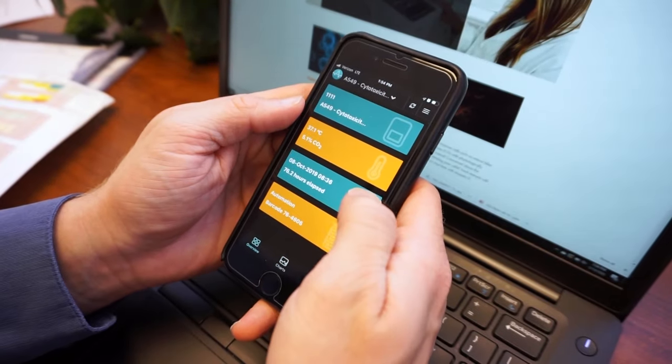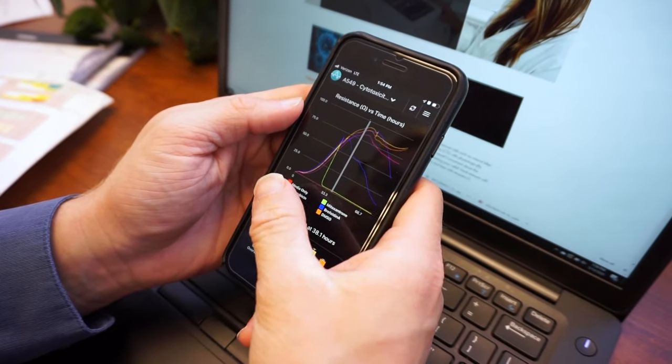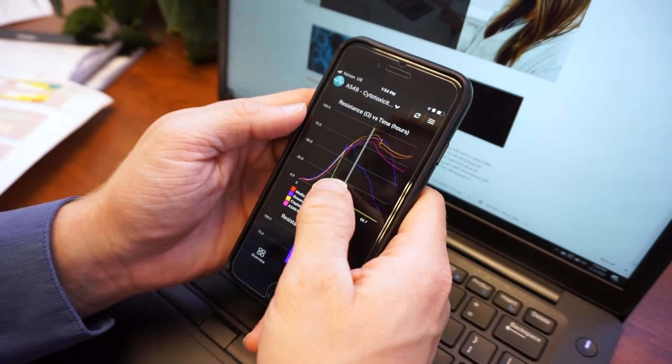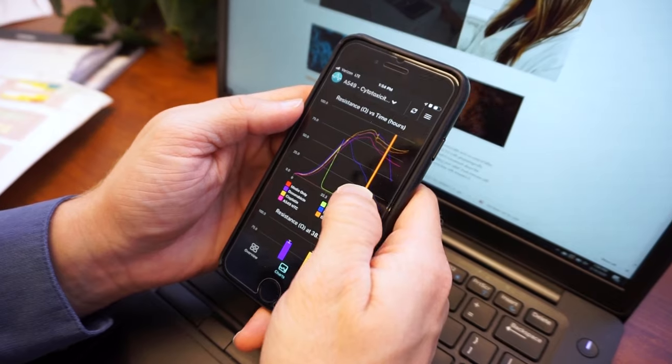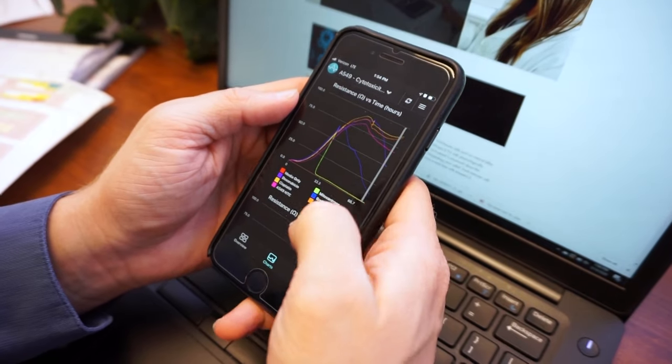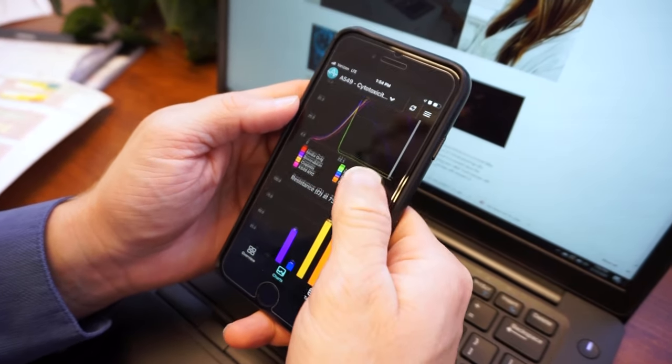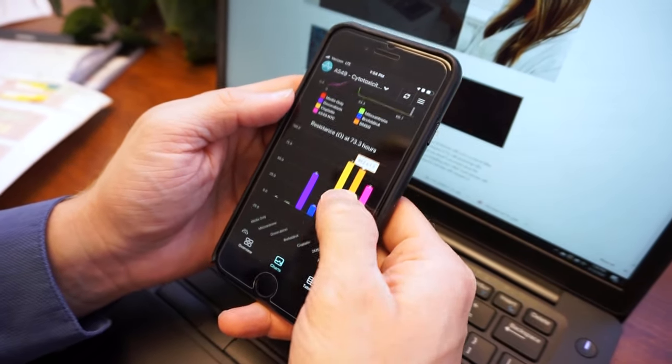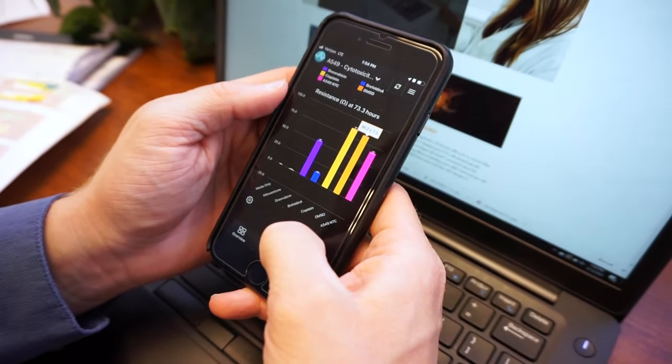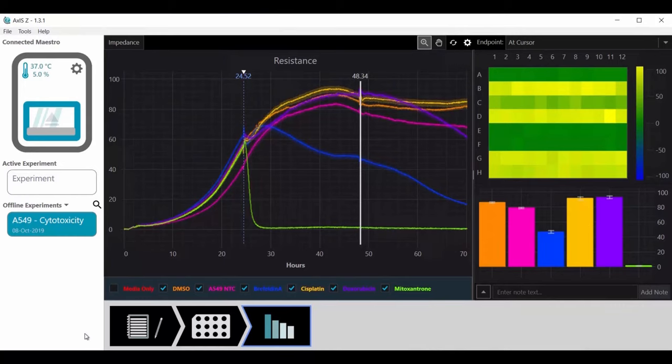Use the Maestro Z app to determine when your experiment is complete. When you're ready to analyze your data, AXIS-Z software makes data analysis a breeze.